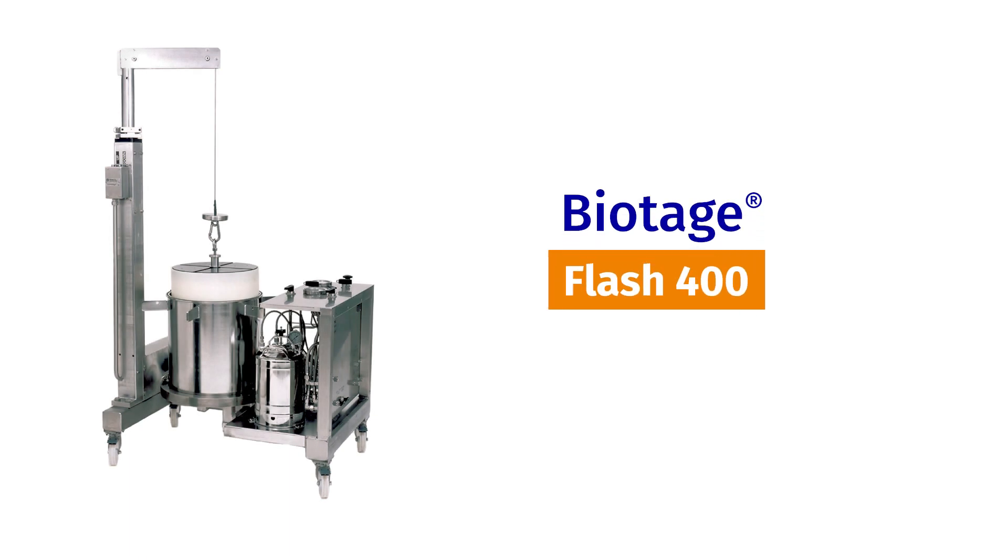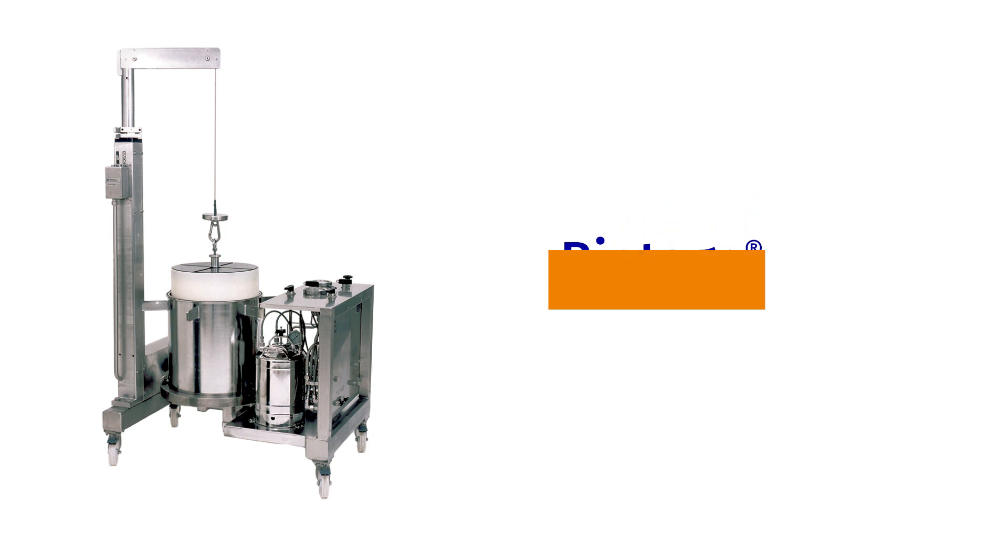Biotage Flash 400 is a complete skid mounted system designed for kilogram scale separations. The system is made up of the following components.